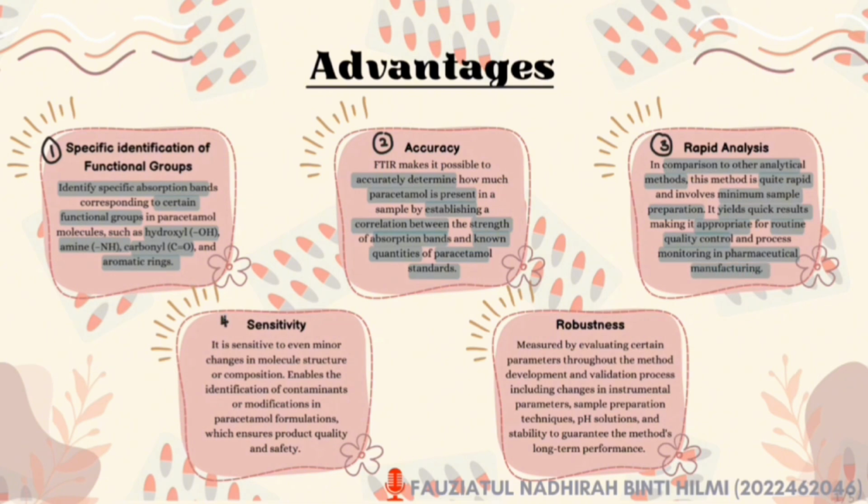On the other hand, for sensitivity, it is very sensitive to even minor changes in molecular structure, which enables the identification of contaminants or modifications in the paracetamol formulation. This analysis ensures product quality and safety.